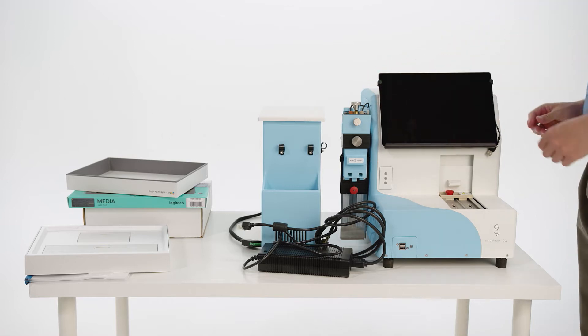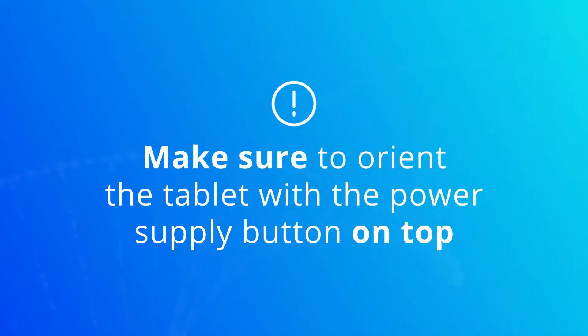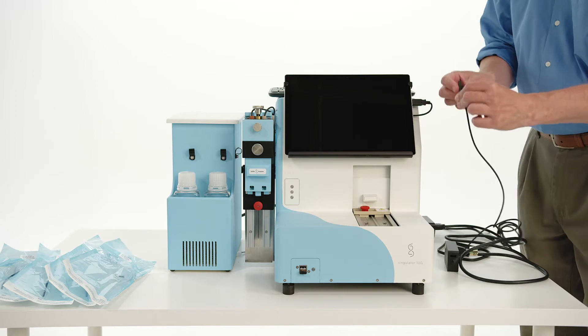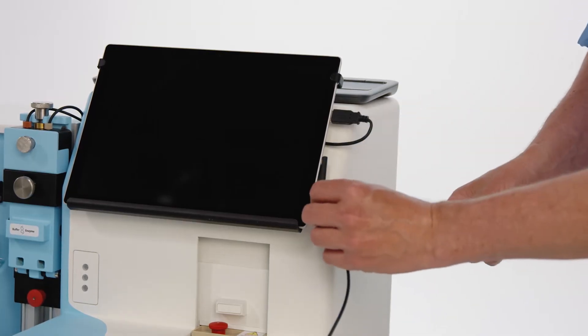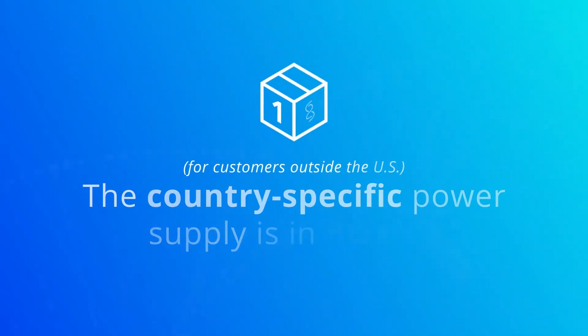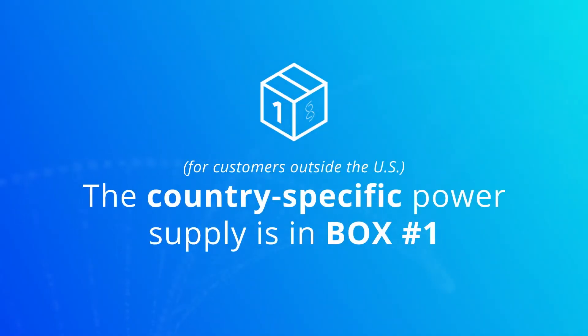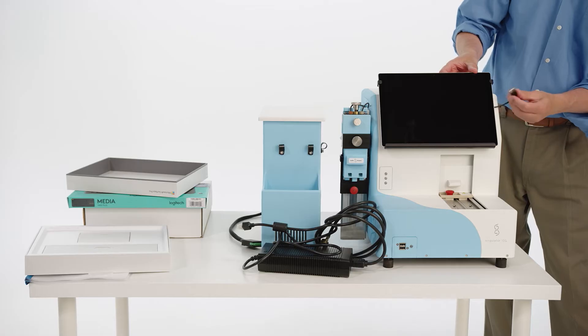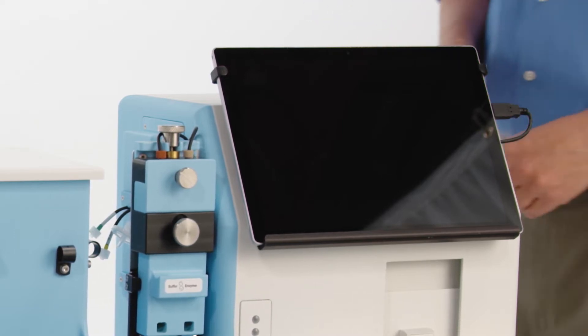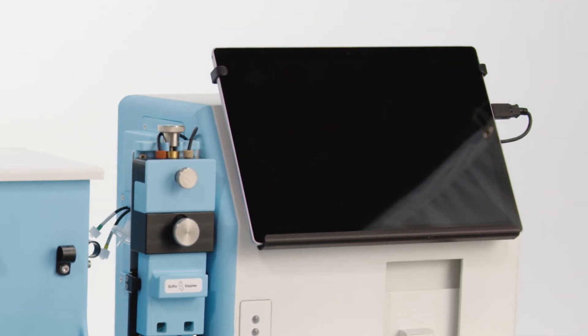Make sure the tablet is oriented with the power supply button for the tablet on top. Connect the electrical plug for the tablet into the tablet power supply, and connect the magnetic connector to the right side of the tablet. For U.S. customers, the power cord plug is in the tablet box. For customers outside the U.S., the country-specific power supply is in box number one. Connect the tablet to the Singulator with the USB cord into the USB slot on the right side of the tablet. Do not turn the tablet on yet.